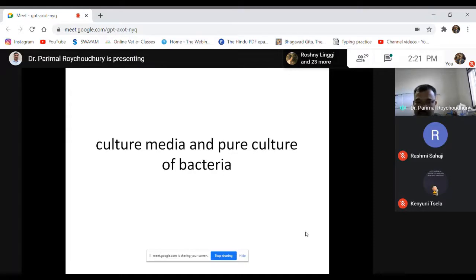Of course, the disease-causing organisms, individual organisms and their behavior we are going to discuss in a later part. Today's class will be the most basic procedure that we follow for propagating the organism. On one hand, I can say it is something like a recipe for the bacteria: how we can cook the food for them so that they will be happy and grow in our culture plate, and we can study them.